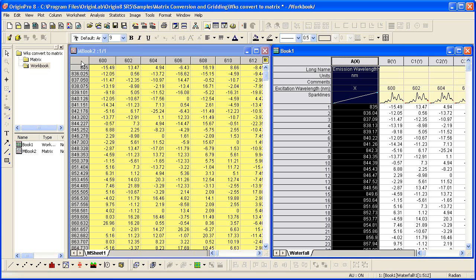If there is too much deviation in X or Y values in the raw data, you would need to first convert the worksheet to three columns XYZ, and then use a gridding method to make a matrix window. But that's a topic for another movie.